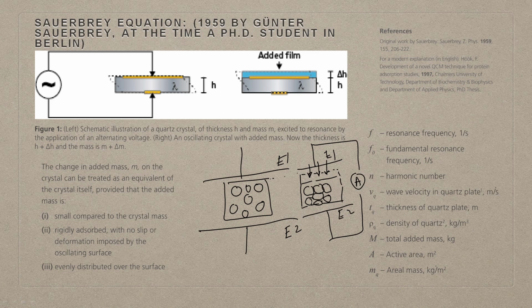These kinds of materials are piezoelectric materials, and the quartz crystal microbalance, QCM as it is commonly called, is a material which exhibits such piezoelectric properties, and such a property could be utilized for a sensor.